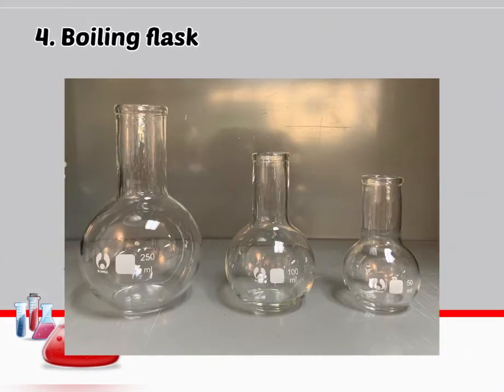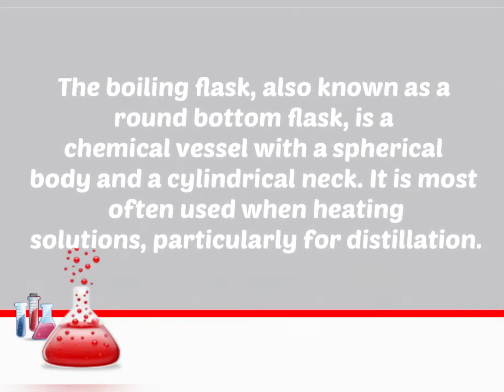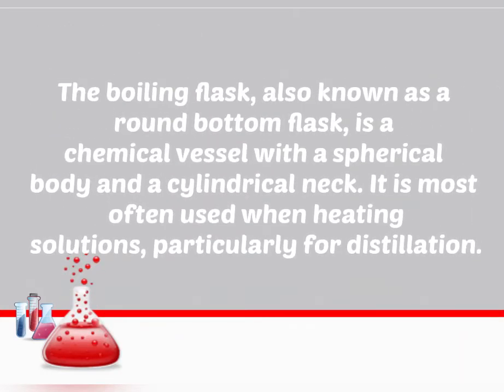Next, we have the boiling flask. The boiling flask, also known as a round-bottom flask, is a chemical vessel with a spherical body and a cylindrical neck. It is most often used when heating solutions, particularly for distillation.